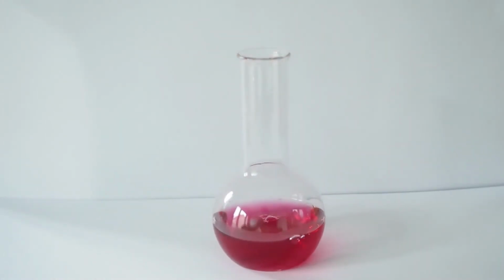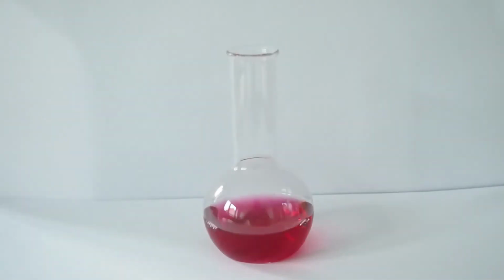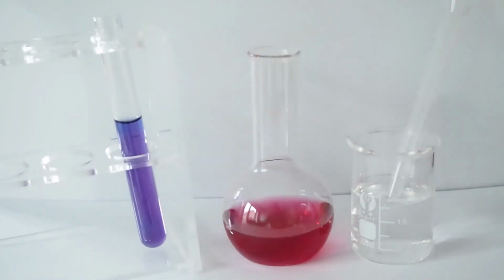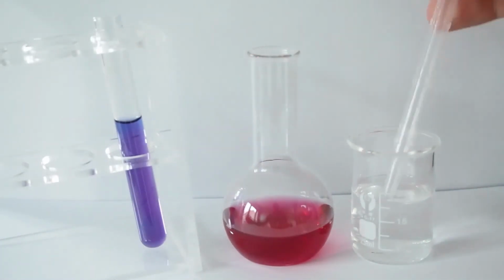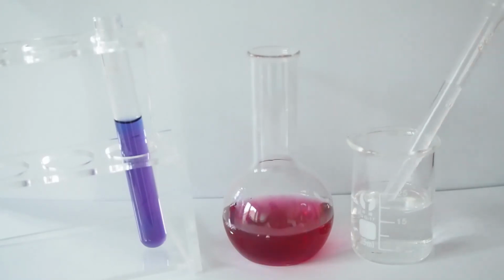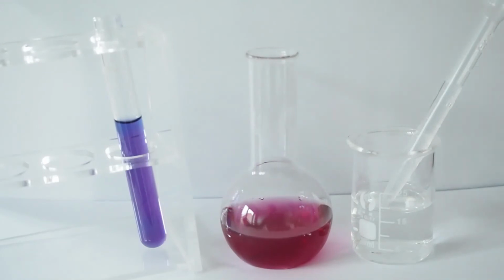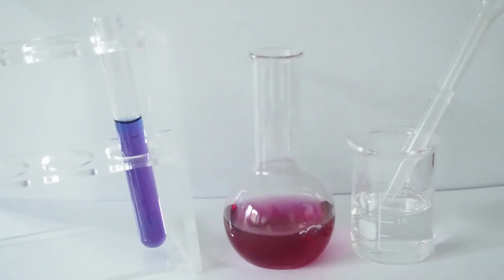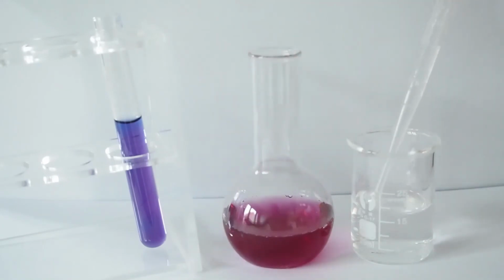Look at that lovely reddy pink that shows we've got an acid present. So now I've got my base solution, my acid solution, and I've got next to them just a standard so I can see when we get to neutral. So there's the first addition in our titration, and we're just going to slowly, mixing in between each addition, add 1 milliliter at a time.